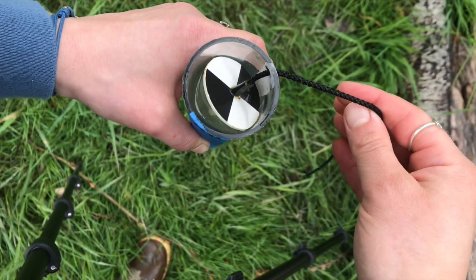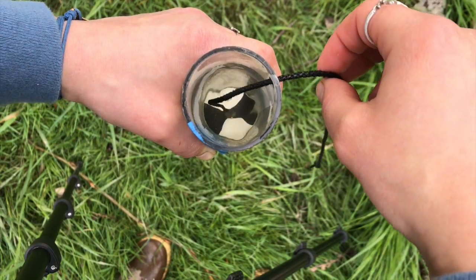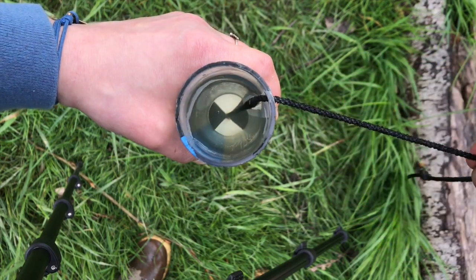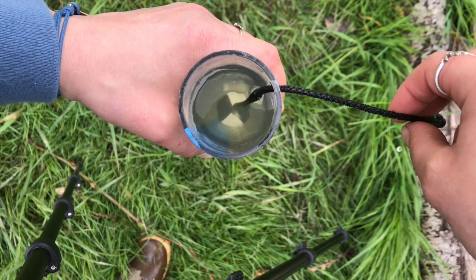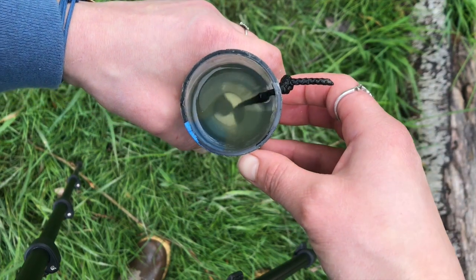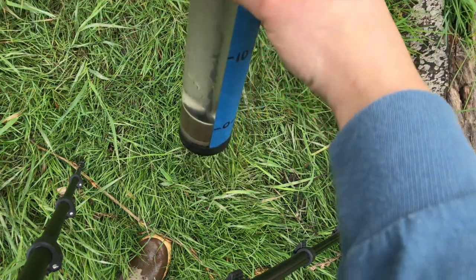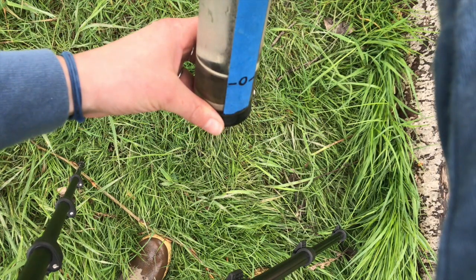Now we're going to test turbidity. This tube is filled with water from Jones Creek, and the small disc you see is called a Secchi disc. We're going to slowly lower the disc until it's out of view. As you can see, we reached the end of the rope and the disc is still fully visible. So now we consult the side of the tube to get our turbidity reading in Jackson turbidity units. With the disc fully visible at the bottom of the tube, our reading is 0 JTUs. Record our results and determine whether or not we met the Salmon Standard.